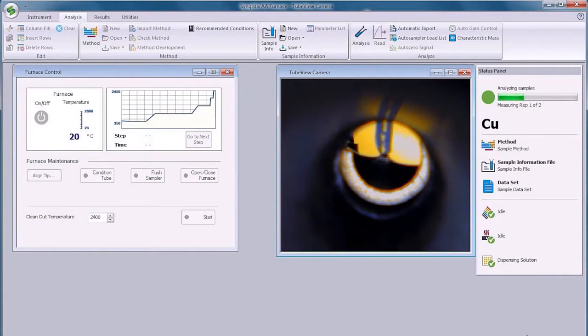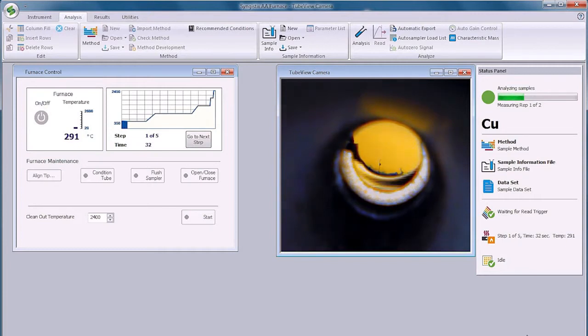Care is required when developing a new furnace program or changing parameters from the default method. Poor drying conditions can result in sample spattering inside the tube, degrading sensitivity and precision.